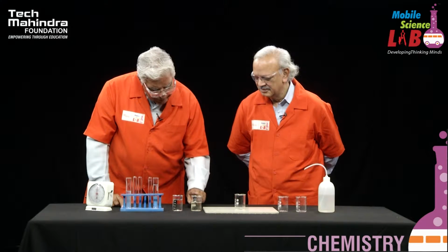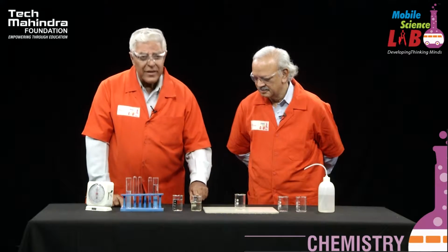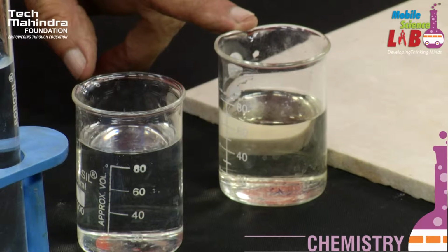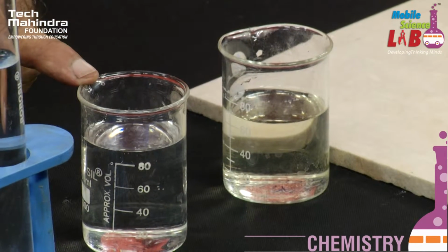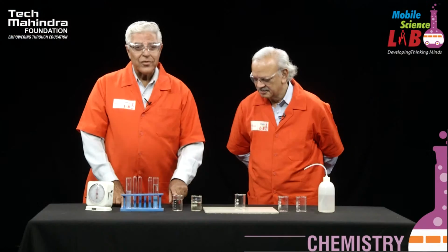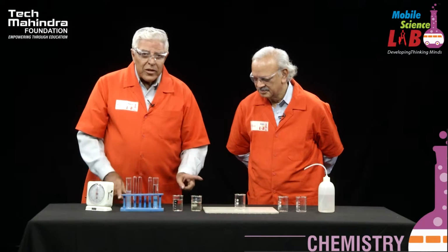So, what we will do is we have taken two solutions. One is called potassium persulfate, as you can see over here. It is a colorless solution. And the other one is potassium iodide, which is another colorless solution. Now, the moment you add these two, you will see some reaction.